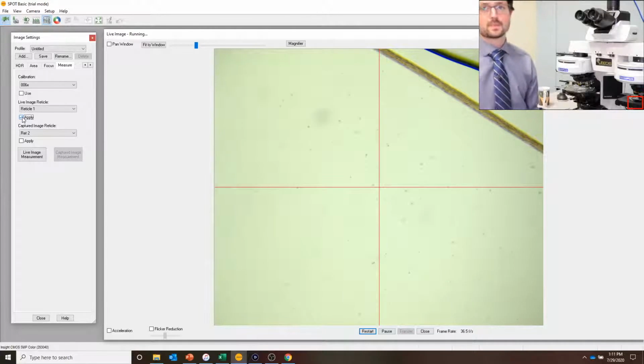So a quick note, on the LCT system, the LCT has two centerable objectives in its nose piece. And so when we do our setups, what we will often do, and I'll explain why in a moment, is we will place the 2 centerable objectives for the 20x and the 40x, the higher magnification objectives, with the 10x being centered on the stage.